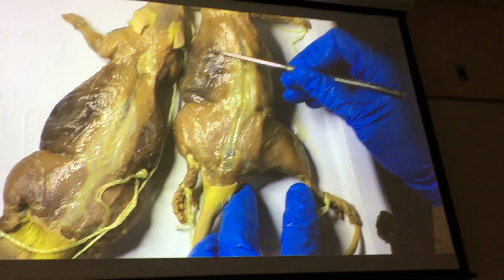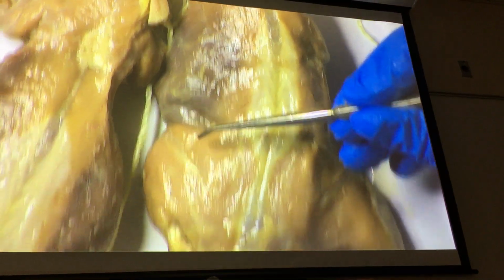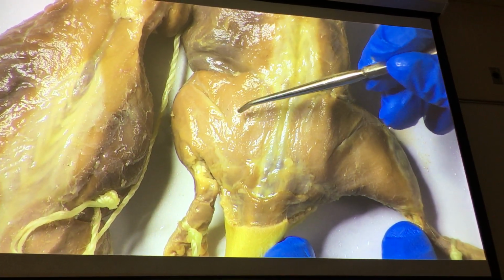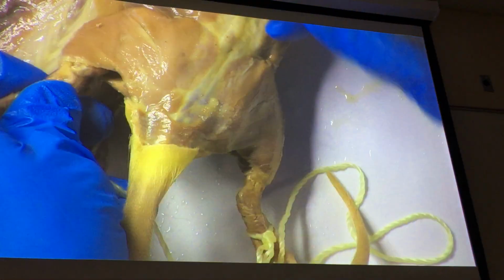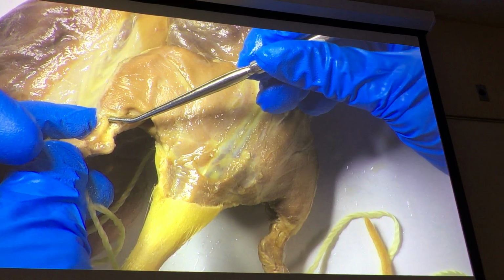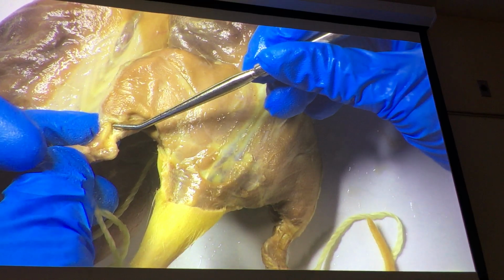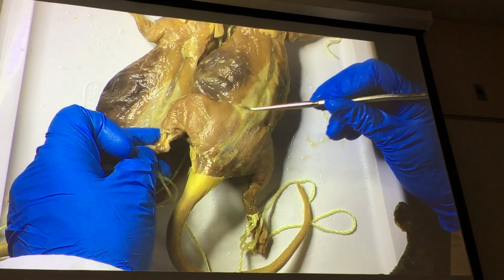Okay, so coming down here, of course, the only muscle anywhere between the lat and the butt, external abdominal oblique. And then, nice big gluteus superficialis. Sounds like the guy I used to date. A superficial butt. Nice big biceps femoris here. Gastrocnemius. And because we didn't go deep on the thigh, you couldn't see the shin muscles, so soleus and gastrocnemius are plenty. Okay? So that's why there's more origin, insertion and action questions, because we don't have a lot of muscles. Anybody need me to do that again, or are you all set?